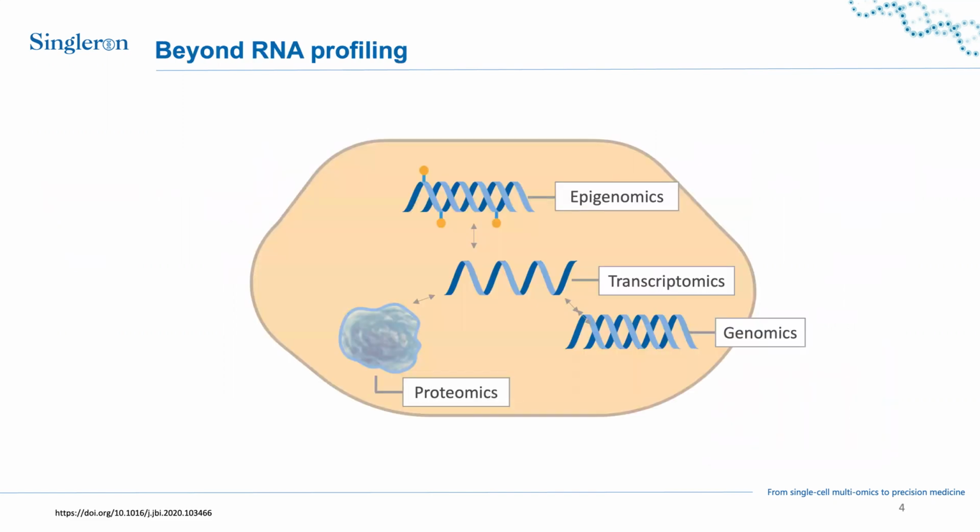Here, for example, you can look at genomics, and at the correlation of genomic alterations and gene expression.